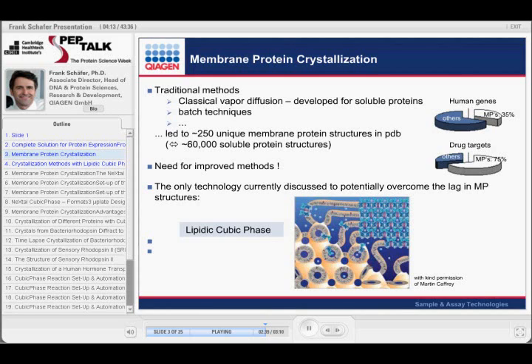Now the membrane protein, as is shown here, can insert into this bilayer, and occasionally some of these proteins, that's the idea, can get into contact and finally form a kind of a lattice that can then ultimately lead to the formation of a protein crystal. So that's the idea of how it could look. I think it's not yet totally clear.